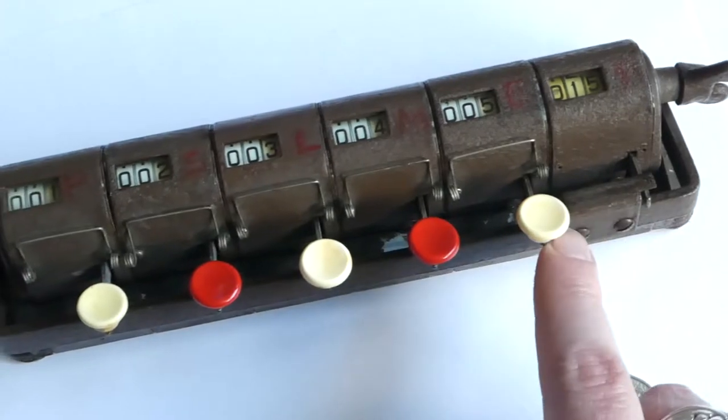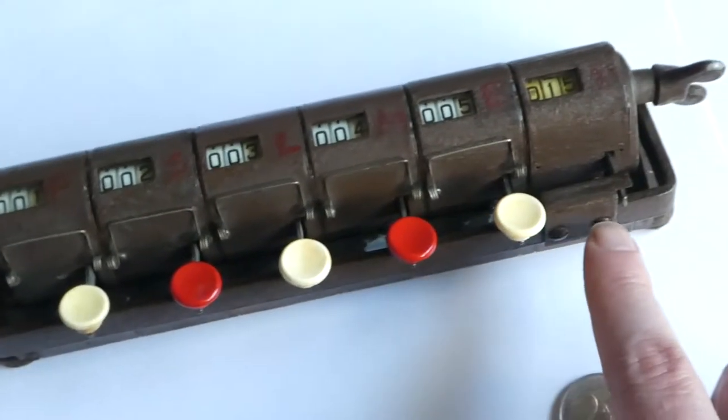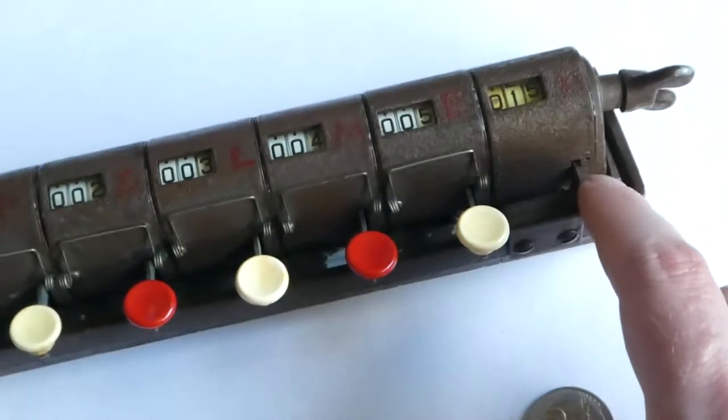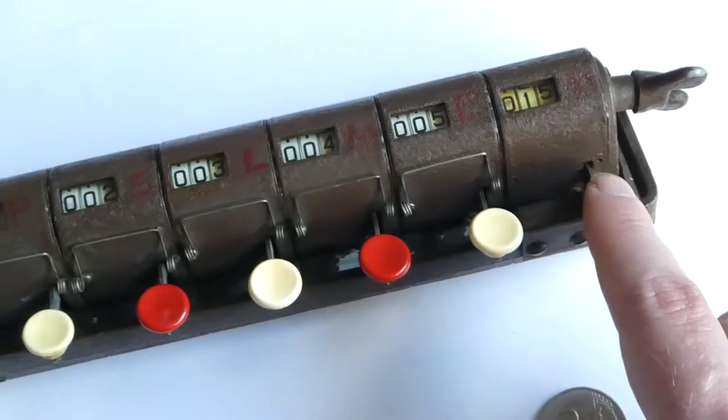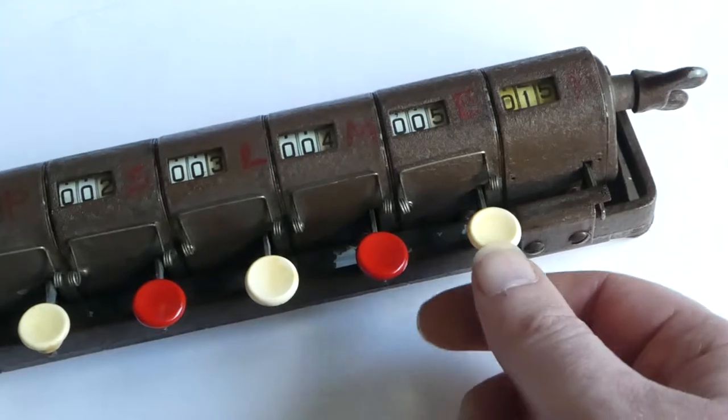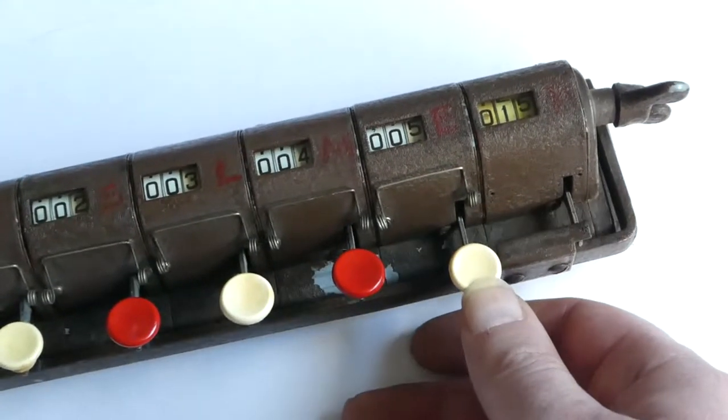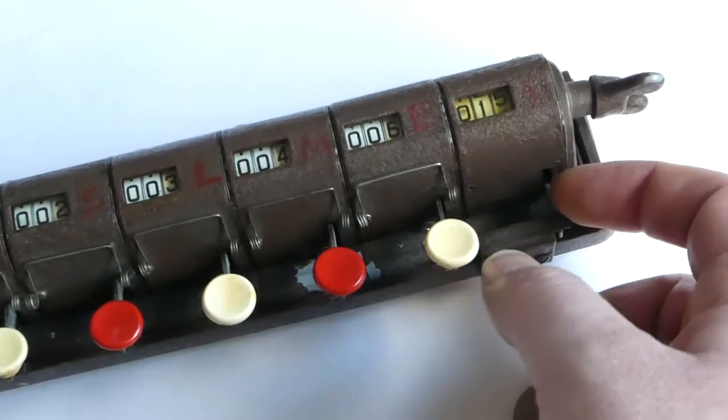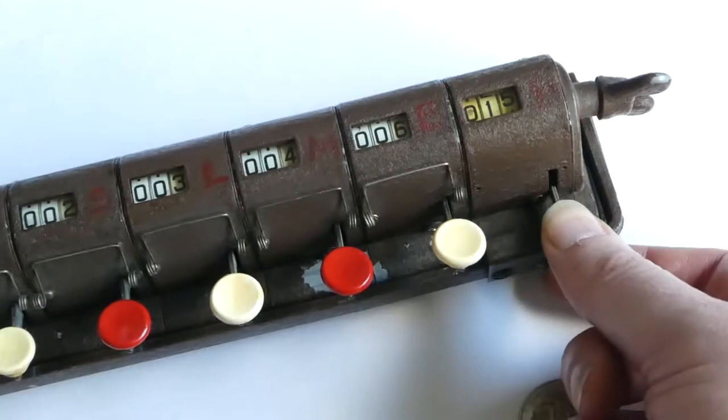Each time you press a button, the button presses down on this bar here, which is connected to this rod where normally a button would be for this counter. So as you press it down, it presses down on the total button as well.